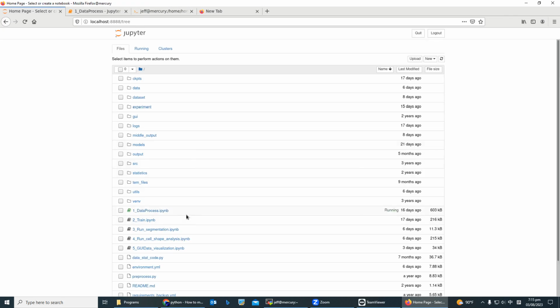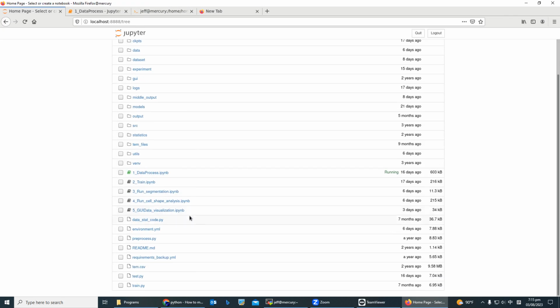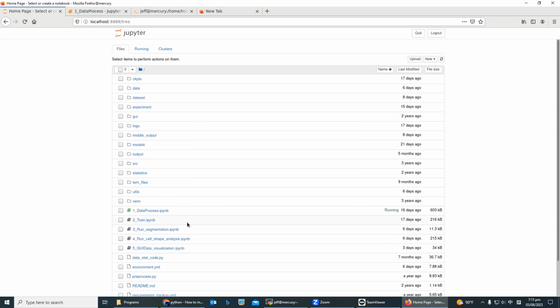Let me show you how to run the CMap software on your own computer. Actually, it is very similar to the steps when you run it on Colab, but it is faster and saves your time if you have it on your own computer, because you can modify the process number, modify the code, and other things more quickly.